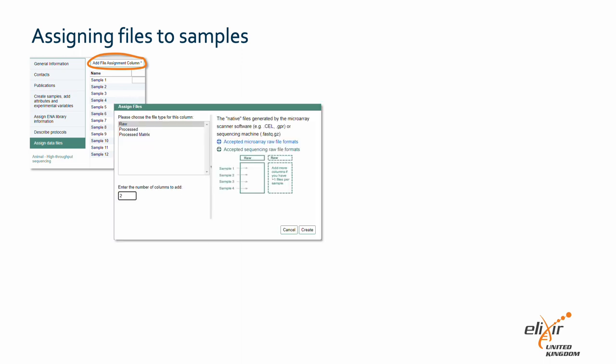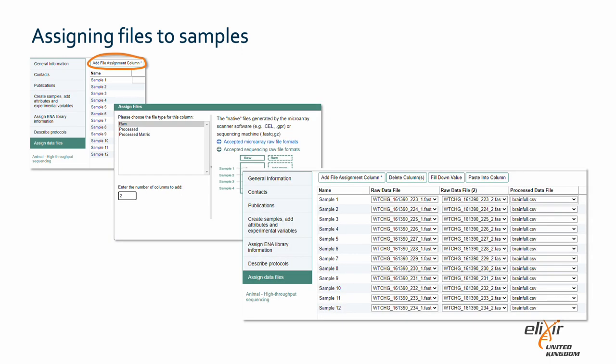Lastly, we need to link each read file to the correct sample. Click on the 'Add file assignment column' button and a pop-up screen will appear. Here you can indicate how many raw read files per sample you have uploaded. In our example, we have paired reads, so we have two read files per sample. We also have one processed data file per sample. When you click 'Create,' the different columns will be generated and you can link the samples to the corresponding read and processed data files.